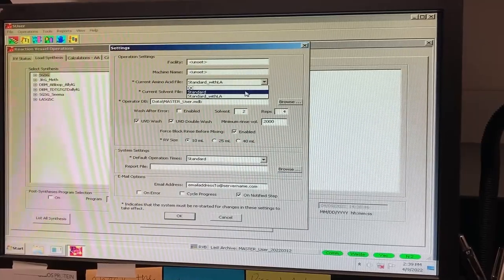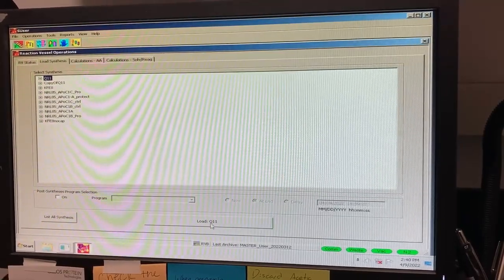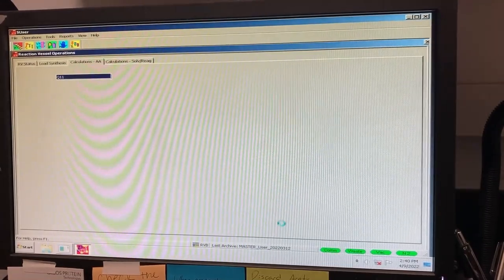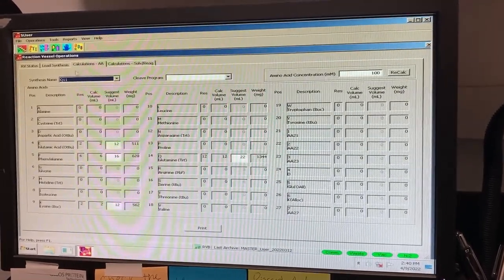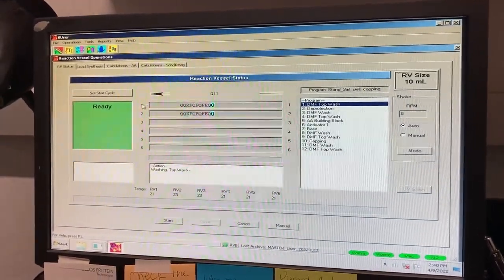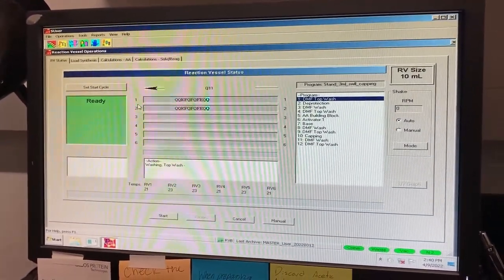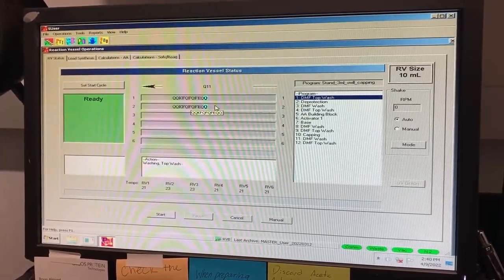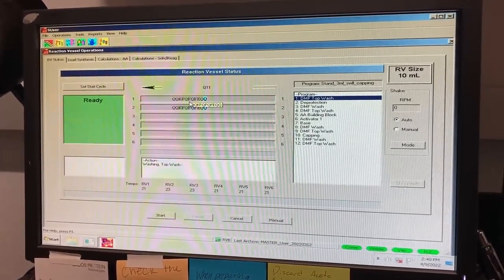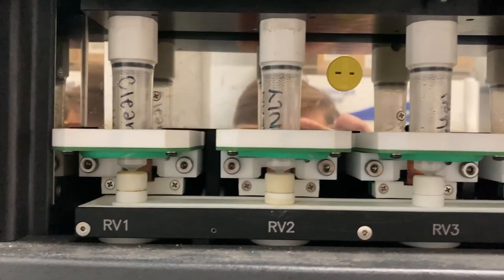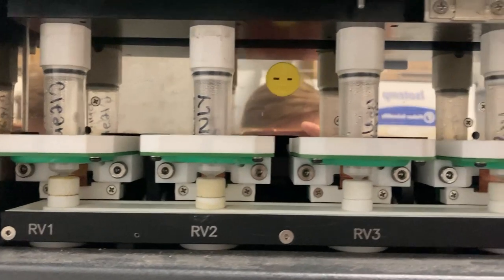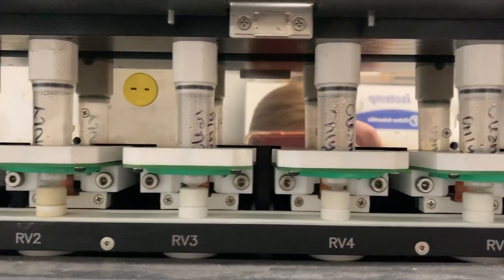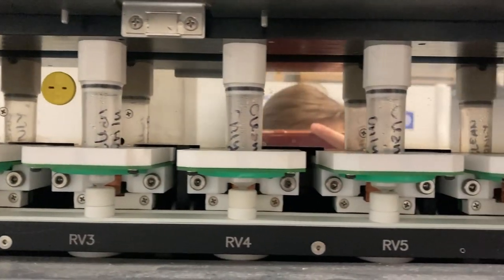Once your file pulls up, select the Load button, which will take you to the RV Status tab. You will notice the boxes listing your sequences are numbered. These numbers correspond to the different reaction vessels on the synthesizer itself. It is important that you note which sequence corresponds to each number and reaction vessel.